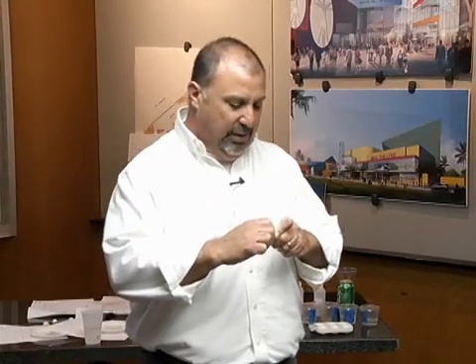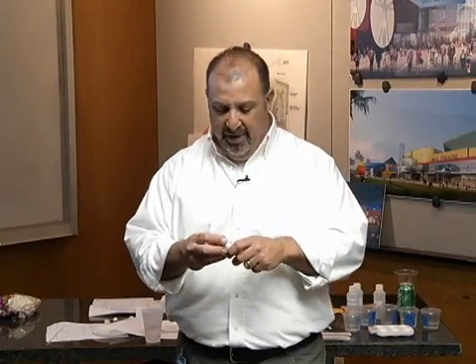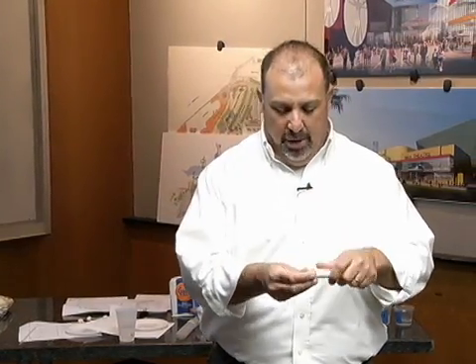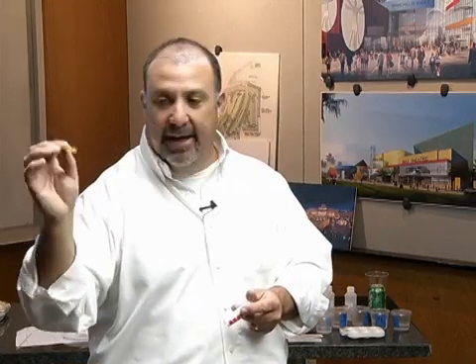The first thing we're going to do is measure just a couple different liquids. You still have your cups of water and vinegar, and we're going to test the pH of water and vinegar. The way we're going to do this first test is, in your kits, you have these little tubes, and they have a little chart on the outside. If you open them up, they have these little strips of paper, paper that's been treated to react with a chemical. It will give us a range of color, and that color is going to be associated with a pH level.